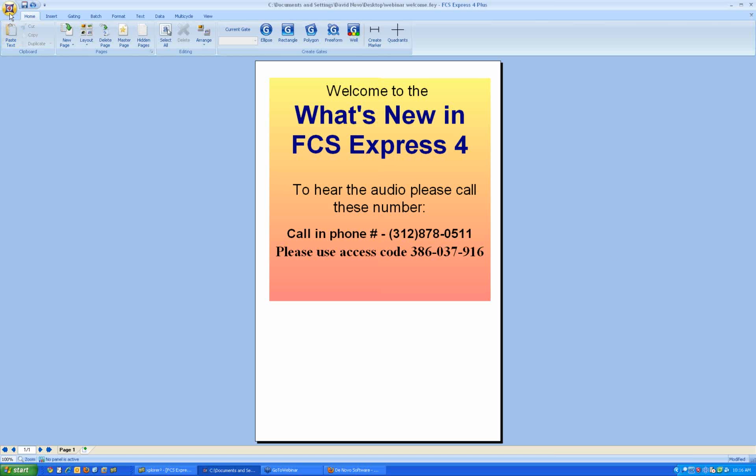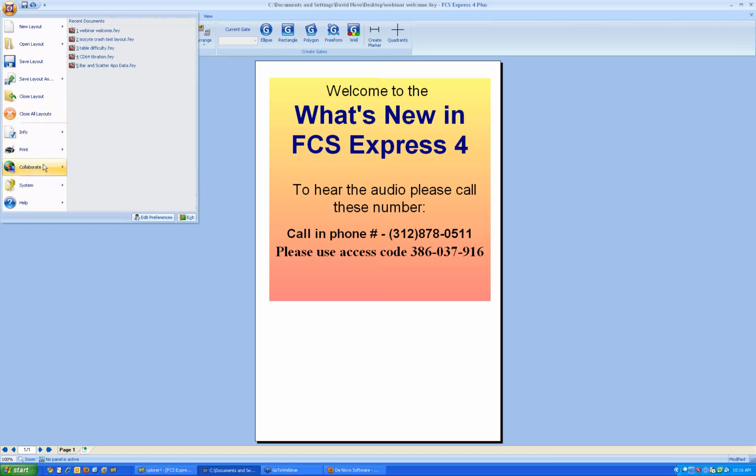One of the other things that we did that is very innovative, that I won't show, but we'll have a webinar on, is our collaboration tool. Built into FCS Express is effectively a GoToMeeting-style software like the one we're using right now, where you can actually host a meeting with any other FCS Express user on the planet.